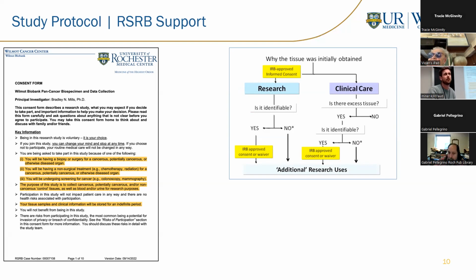So there's a lot to this, right? I think when you're talking about the actual processing, if there's enough whole blood, we can isolate serum from non-heparinized tubes, and then plasma and mononuclear cells from a heparinized tube, right? My preference, whenever we have a limited amount of whole blood, is to do a plasma and mononuclear cell isolation, right? But yes, we have at this point several serum samples as well.